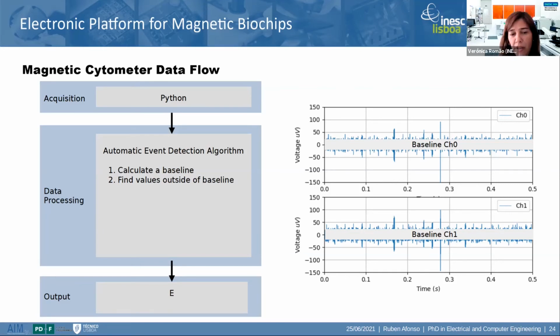Yeah, just to add here, when you mean magnetic interference, is it when you reuse the chip? If you have a reused chip that already has particles from previous experiments, if it was not well washed out, it can have some particles that interfere in the next experiment. Ruben, no? Okay, so clarify this, sorry.